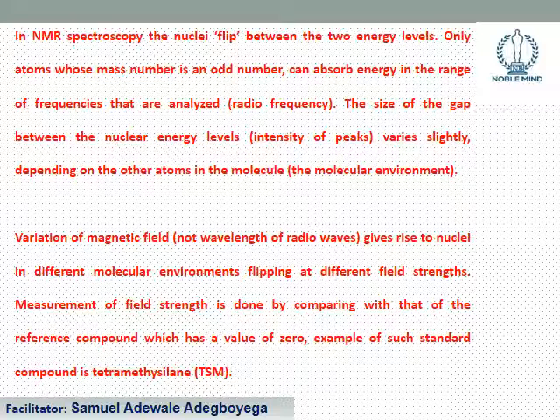Okay, change in magnetic field, not changing the radio frequency wave this time around, is what gives rise to nuclei in different molecular environments.